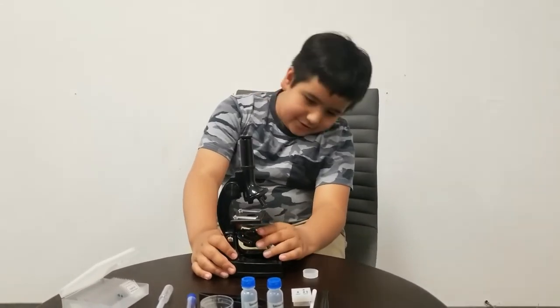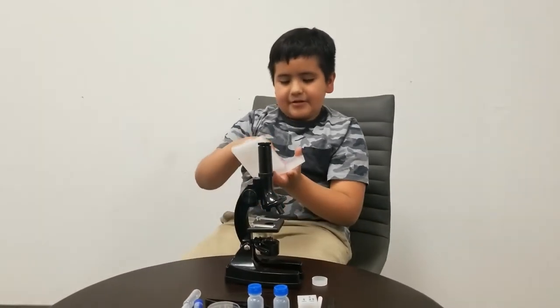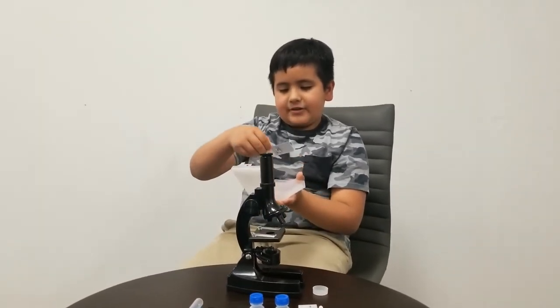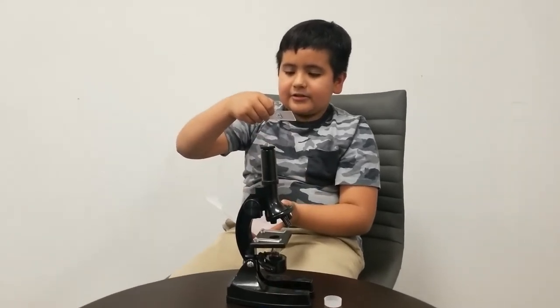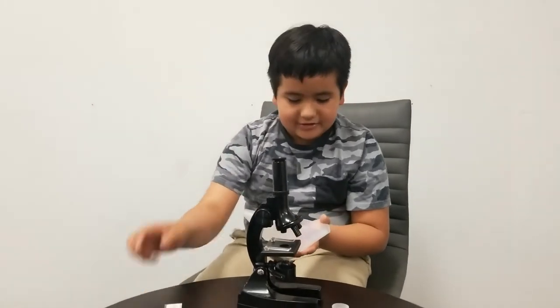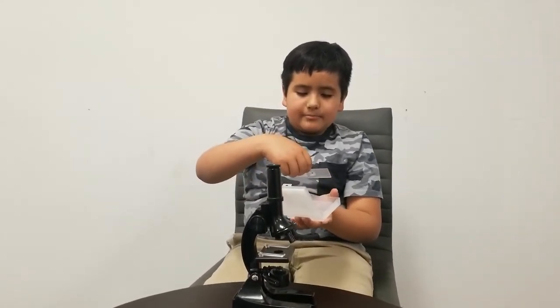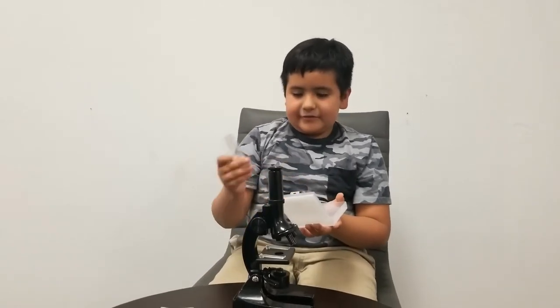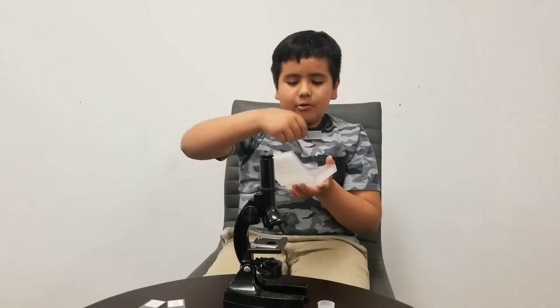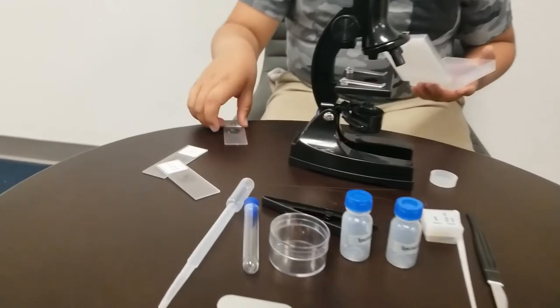With the set there are three pre-made slides. There is a hydrilla verticillata — that's a leaf, I don't know how to pronounce that. Broad bean — I don't know how to pronounce this leaf either. And onion bulb — I don't know how to pronounce that so I'm just going to call it onion bulb.